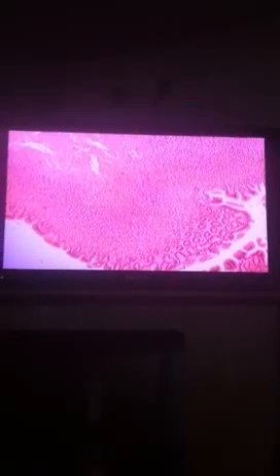That's about as best you're going to get it. This is kind of a smaller representation. You have the oblique, here's the longitudinal, and the circular is right in the middle. You kind of see the difference in the patterns as you look at them. There's some difference, you'll be able to pick it up. But it depends on what they're looking for.